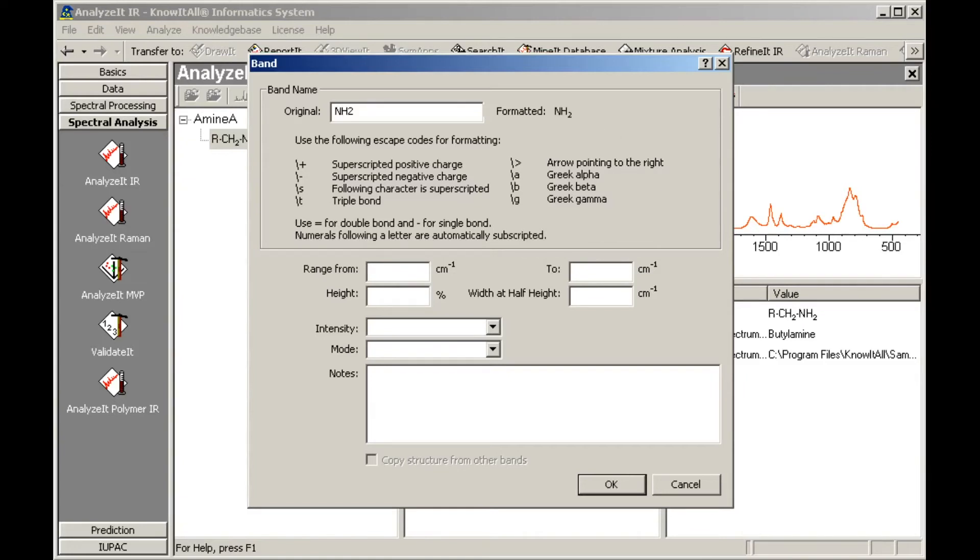Type in values for the range, height, and width at half height. Note that if the range is too narrow, the peak may be missed. Using a broader range than the spectral peak may give better results.